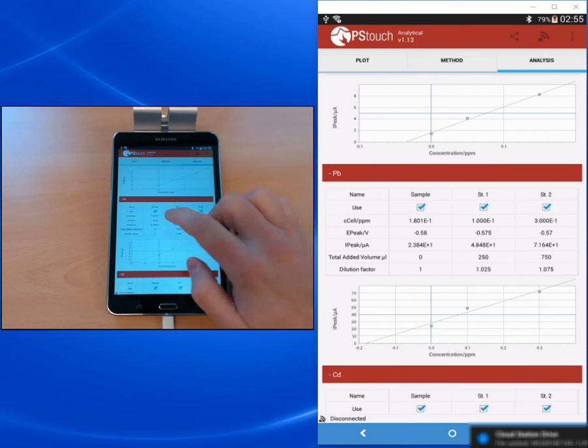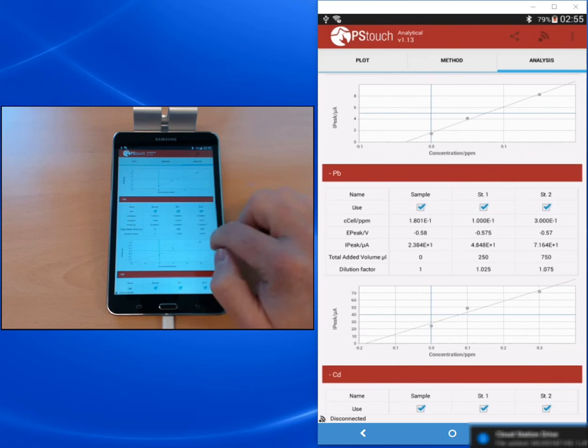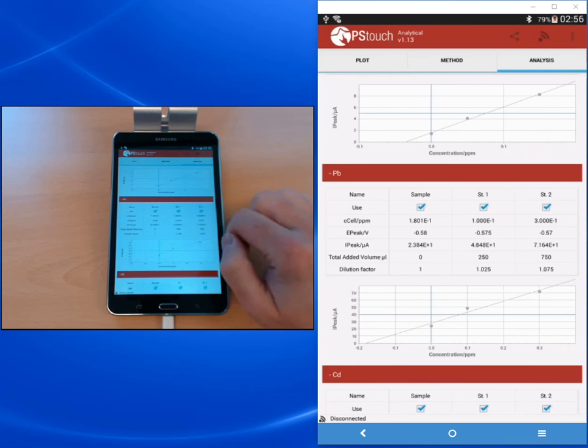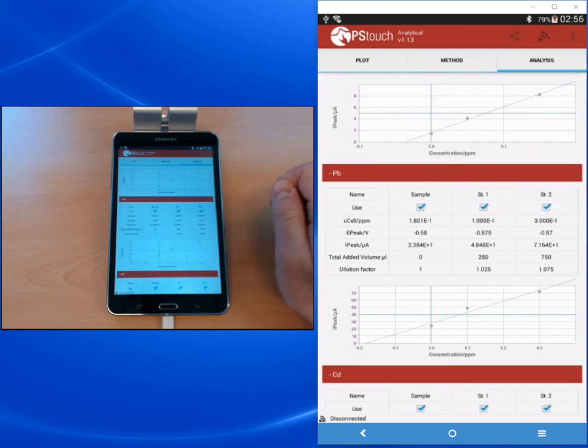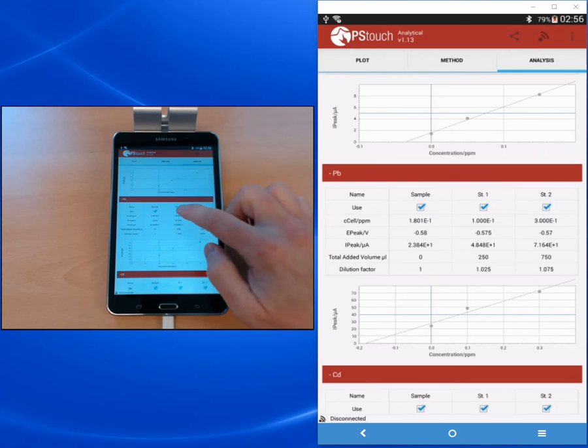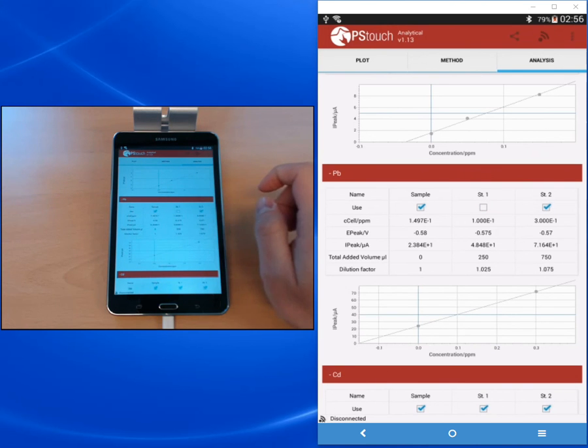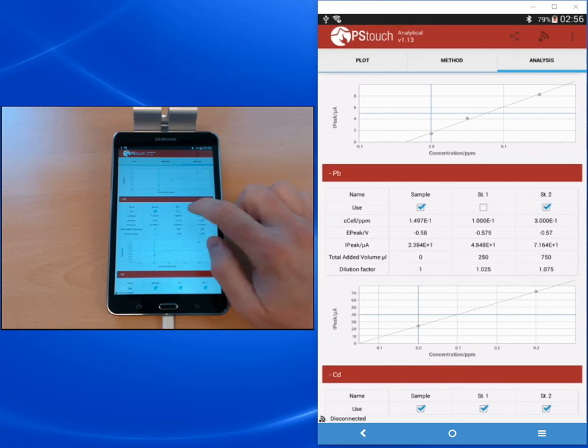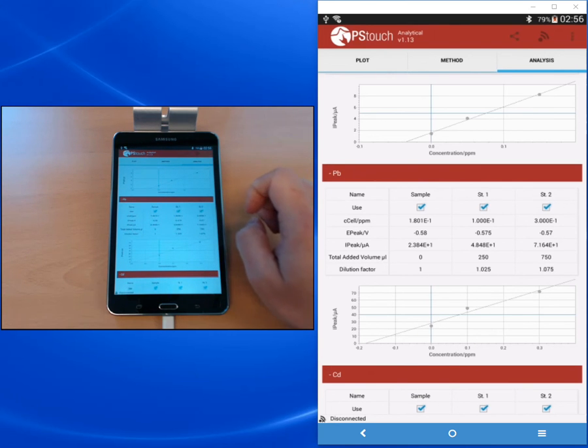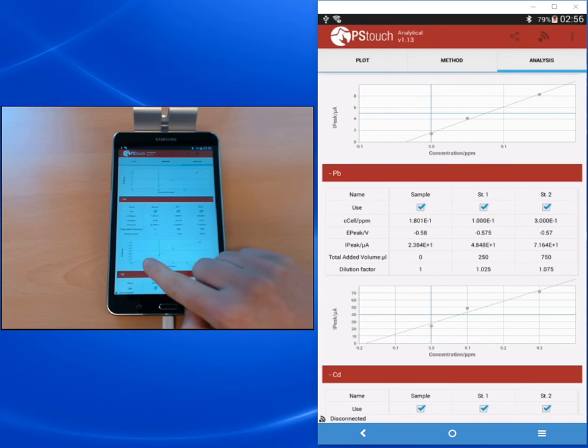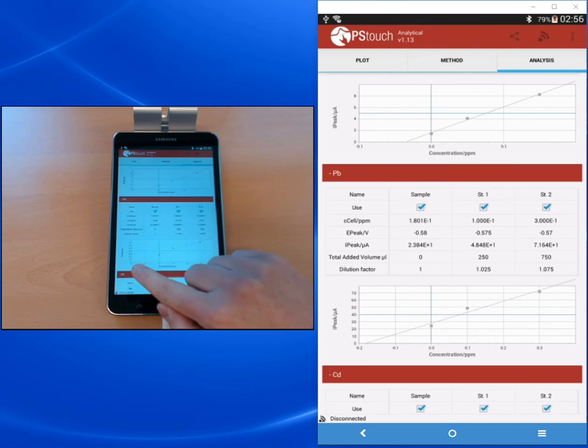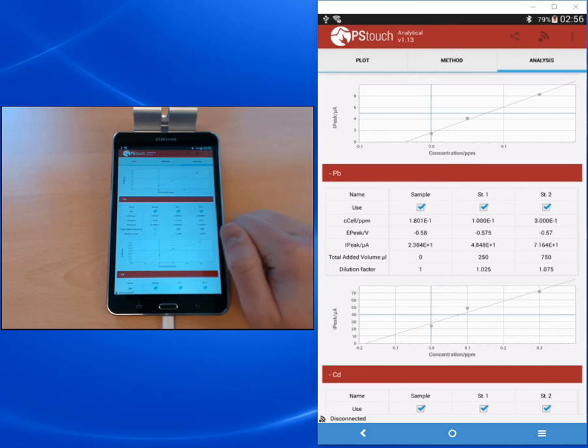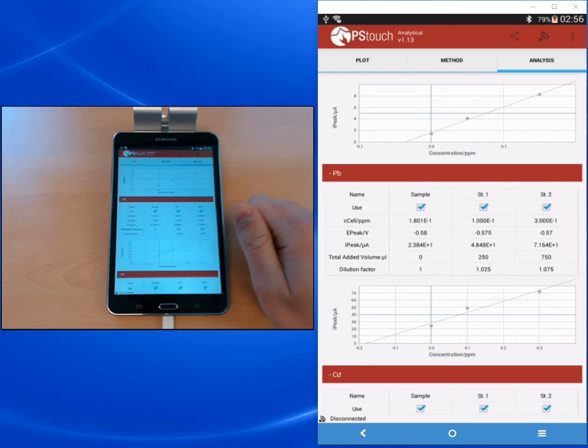Then you see below the curve. This curve shows the points and the linear fit. You can see that if a point doesn't fit, you can switch it off by checking or unchecking the use checkbox. This is handy if you have an outlier from the line. Here you see the linear fit, and where it ends at the x-axis is our unknown concentration in the standard addition method.